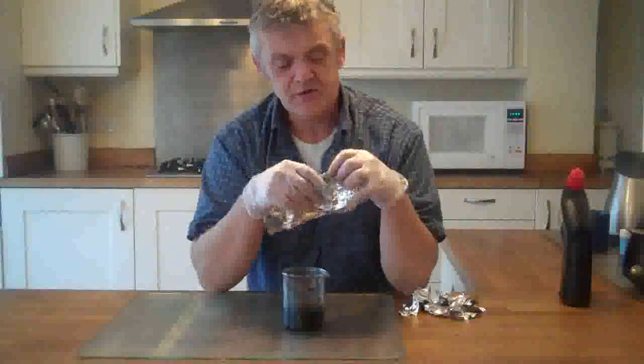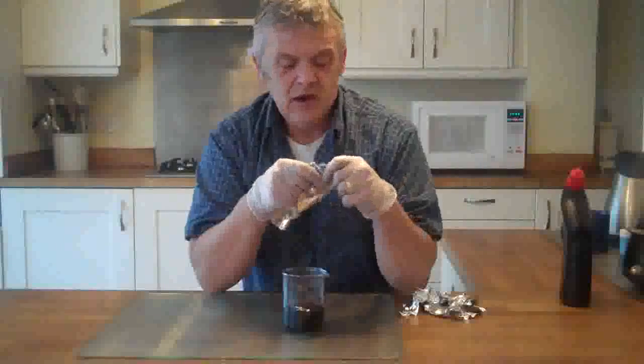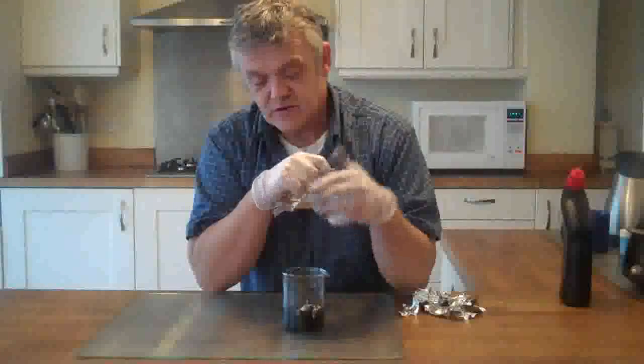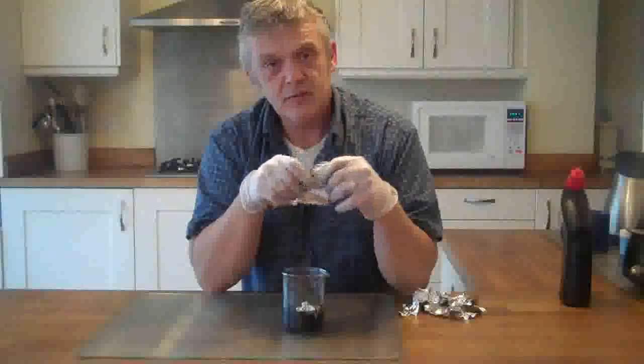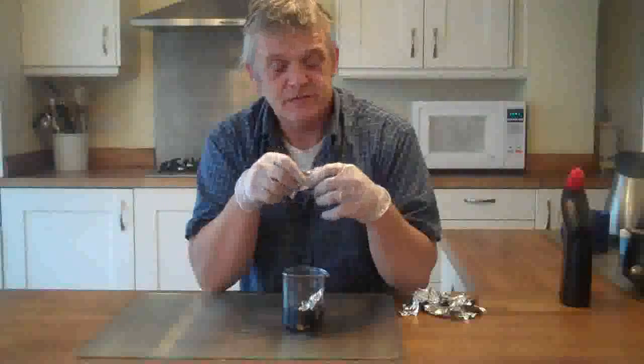And all you do is get a bit of ordinary kitchen foil, and just chuck the kitchen foil in. Now, there's no real weight or measure for this, because this foil is going to be reacting, and when the reaction has finished, there'll still be little bits of foil left over.